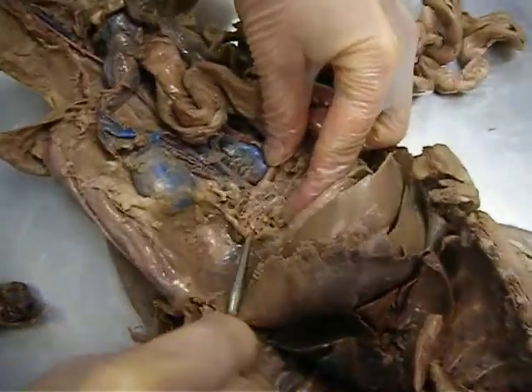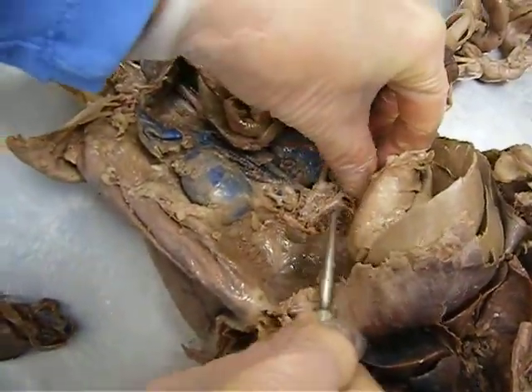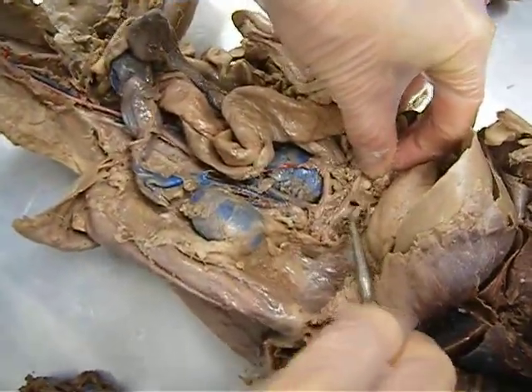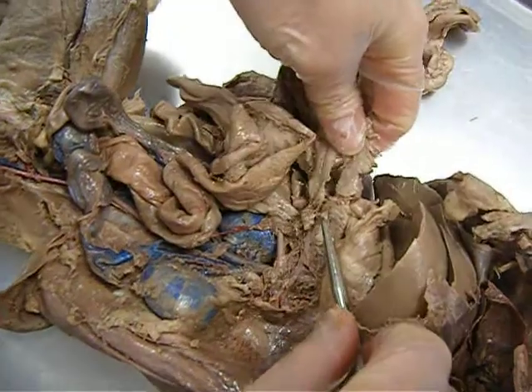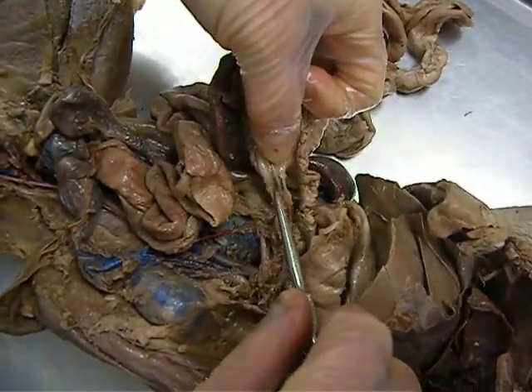This top pink one coming across from the aorta is called the celiac. First branch going up and under is the hepatic to the liver. The second branch going to the stomach is the gastric, and the third branch that goes all the way across to the spleen is the splenic. Right in there.